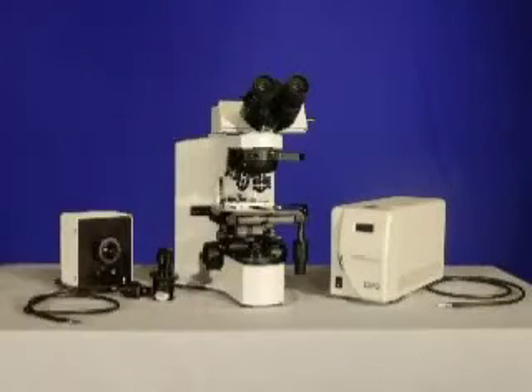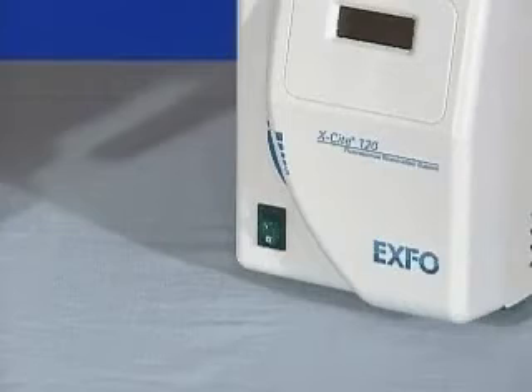The unit is compatible with the EXFO EXCITE 120 and with a SOLARC unit. A SOLARC light source can be used for basic fluorescence techniques; however, considering the intensity and spectral characteristics required for most fluorescence, we recommend using the EXFO. For the purposes of this demonstration, we will use the EXFO.